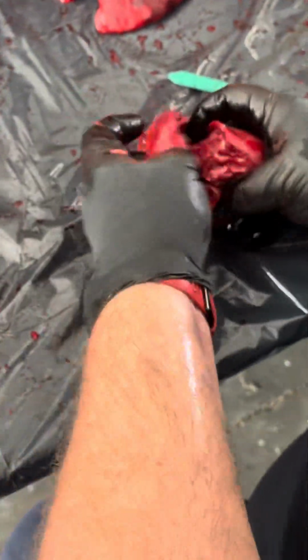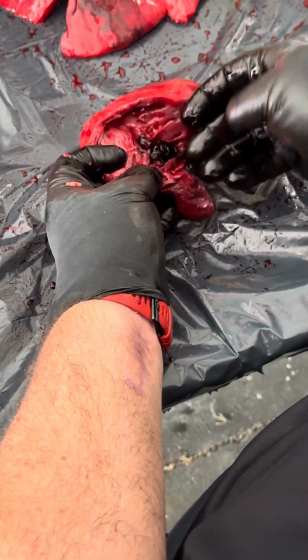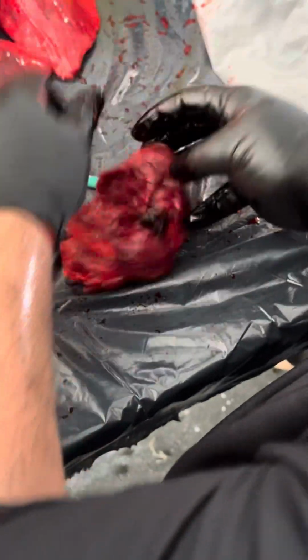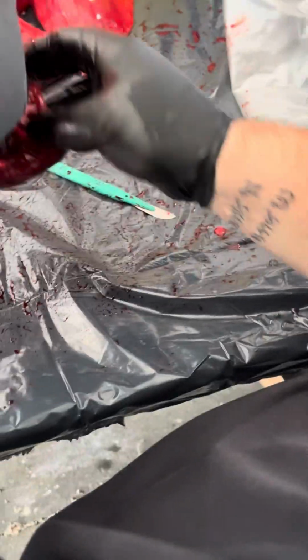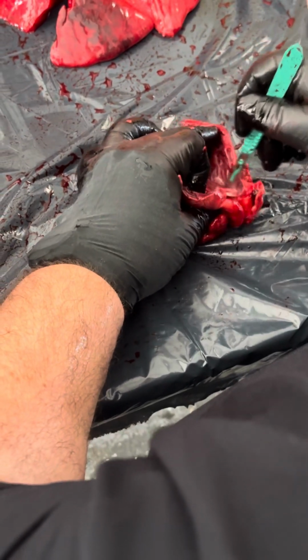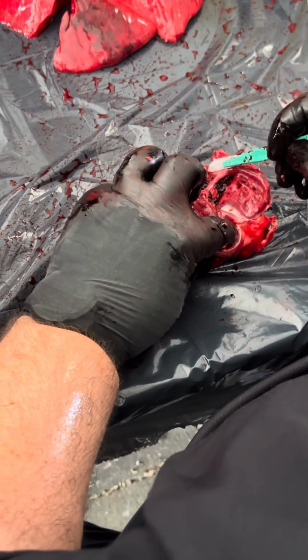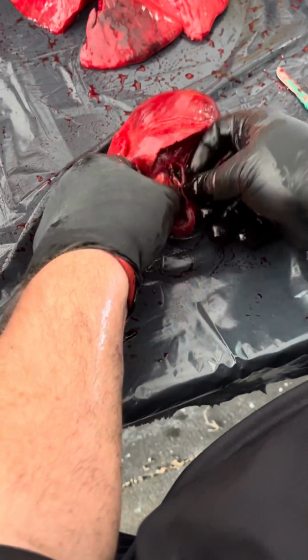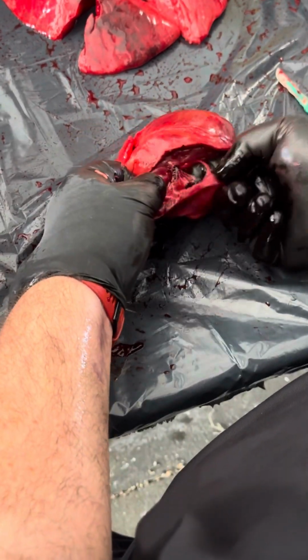On the inside, what you have is you have these papillary muscles. All these muscles down here on the bottom. There's some big old clots in there. All these papillary muscles down here on the bottom hold your chordae tendineae. All of these things that are holding up here. All of this stuff that's holding up is your chordae tendineae. These chordae tendineae are actually holding these valves. So this is your tricuspid valve.